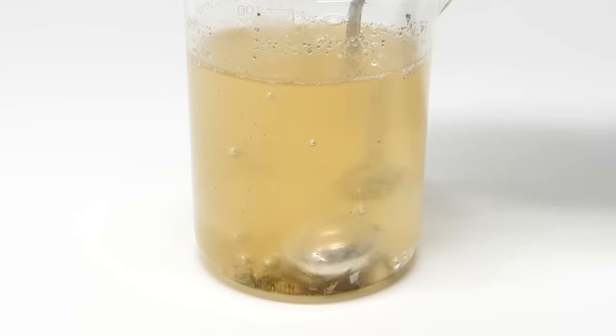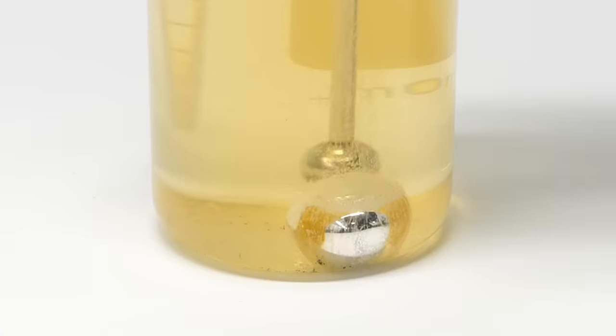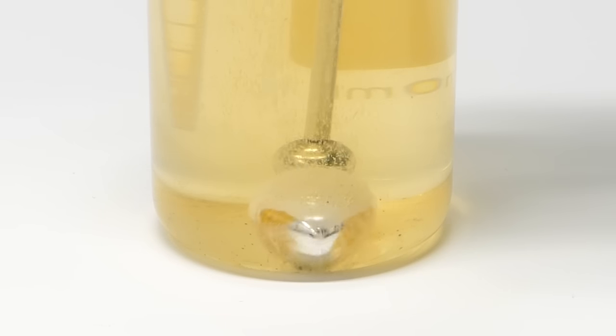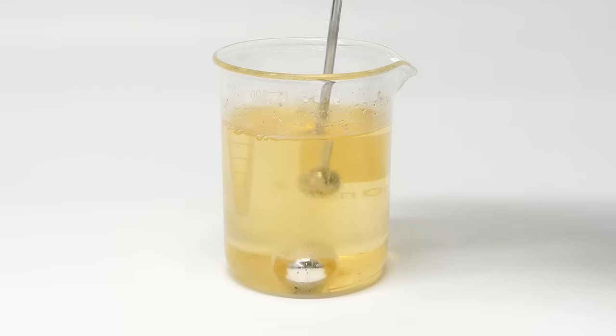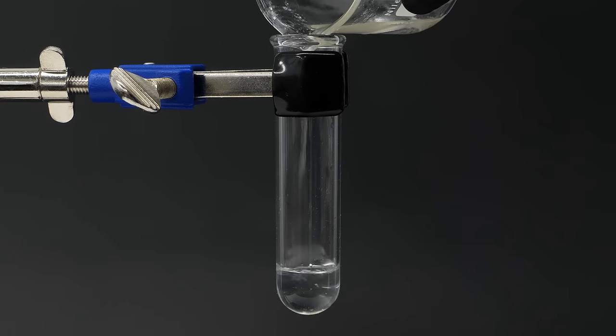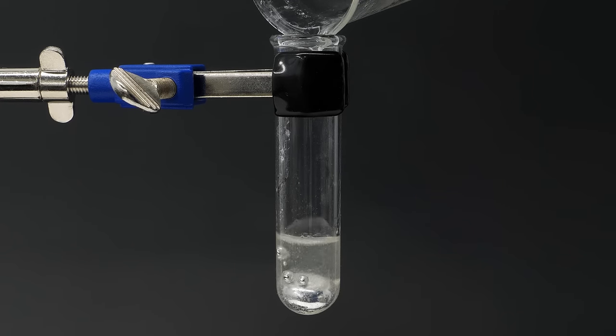I then stirred this around for another couple minutes, and I eventually had a perfect ball. I poured off almost all of this dirty yellow kerosene and I transferred it to a test tube with some fresh kerosene.